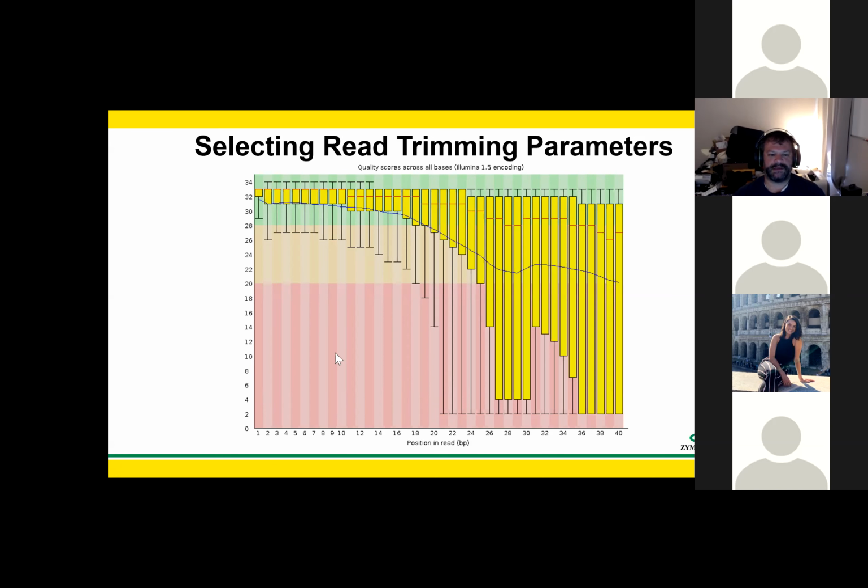So it's basically going to cut all the reads to the same length. It's going to look at the qualities for the read, and it's actually just going to take any read pair where one of the members has over the allowable number of expected errors, and it's going to throw out that read pair.